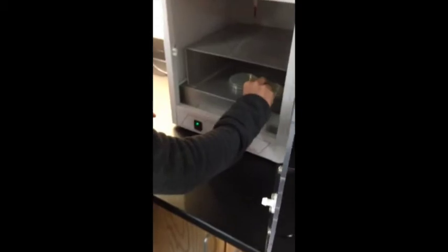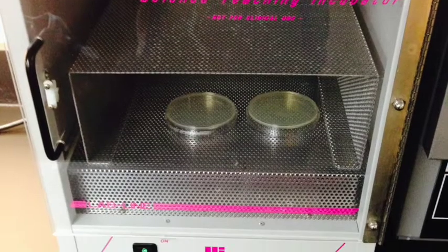We put the plates in the incubator at 37 degrees Celsius.